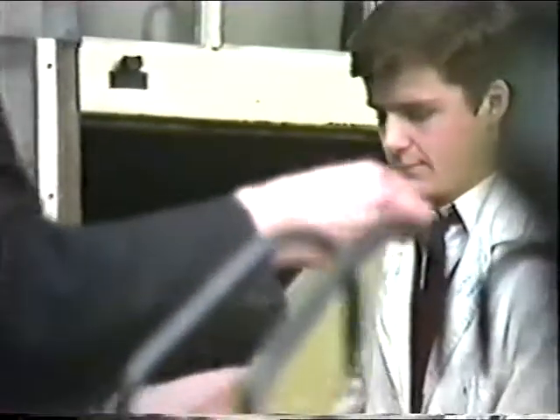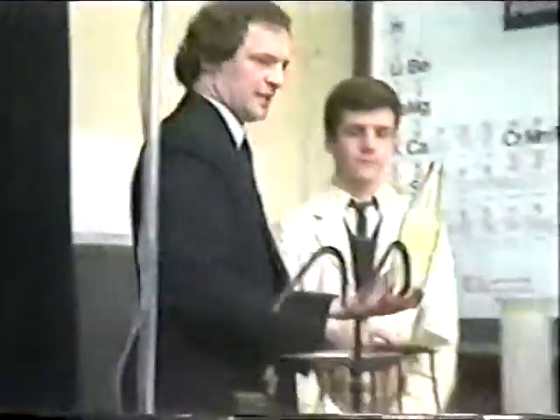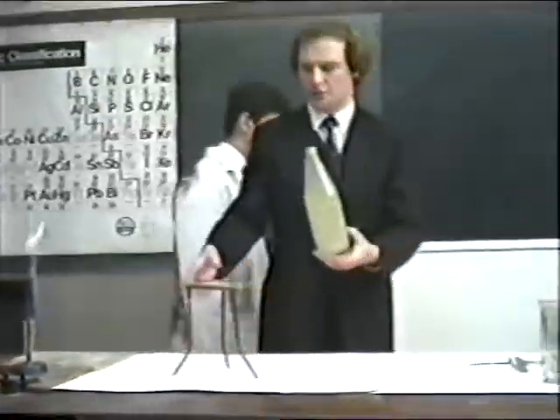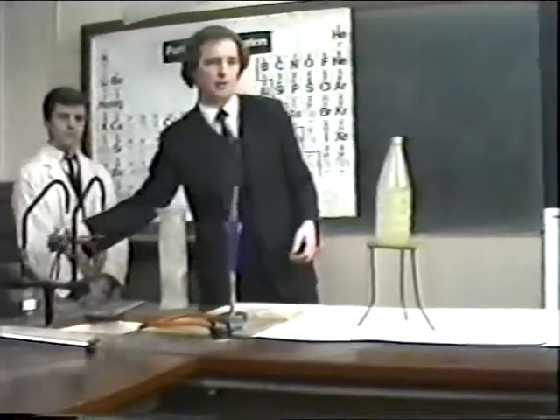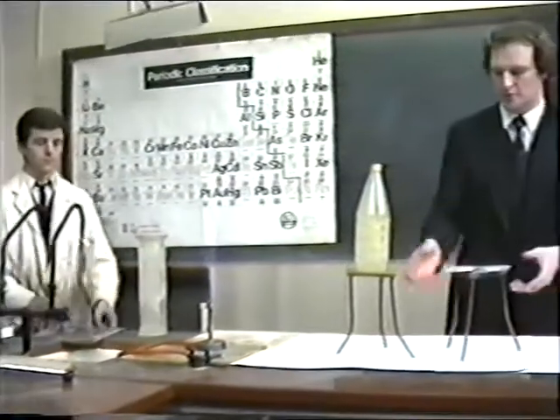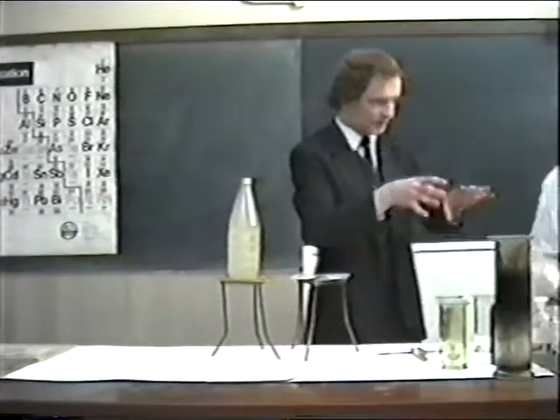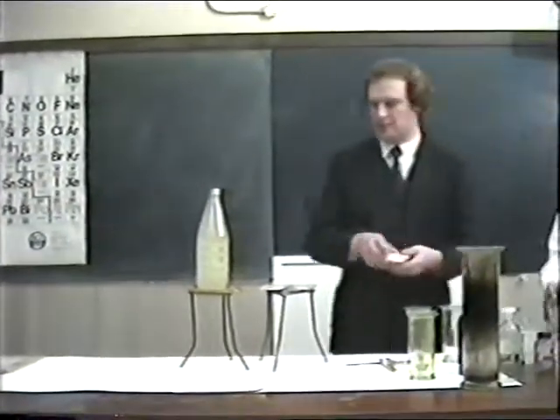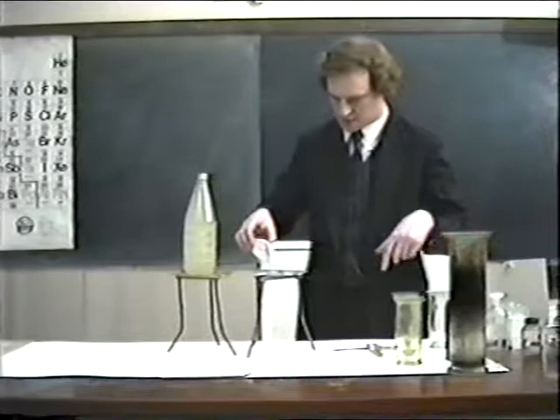Now then, we have here a mixture of hydrogen and chlorine. Now this mixture is quite stable and unreactive when it's in a reasonably dark room. However, when we place it in the vicinity of strong ultraviolet light, the hydrogen and chlorine combine together explosively to form the gas hydrogen chloride. Now, could I ask you two chaps, at this moment, to move all the apparatus further away? I will deal with the real experiment here. No, just move this way, just this lot here, nothing else.